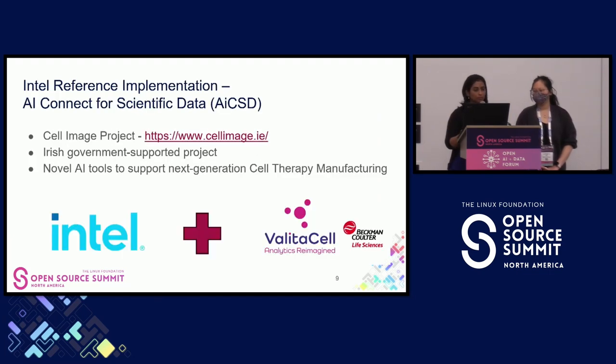So what we developed here was a reference implementation called AiCSD, or AI Connect for Scientific Data. This is part of a larger project called the Cell Image Project, which is funded by the Irish government. What they are involved in is basically developing novel AI tools to support the next generation of cell therapy manufacturing.